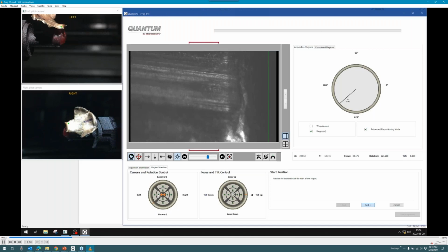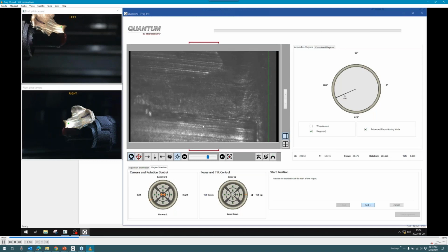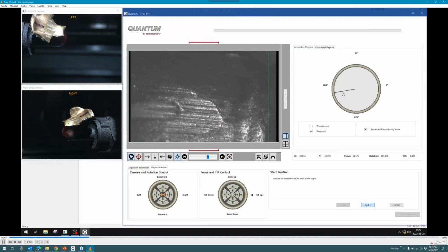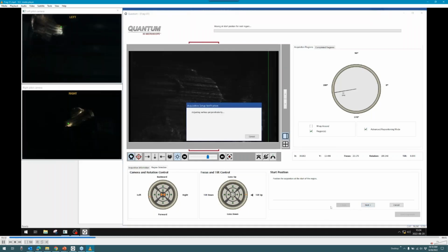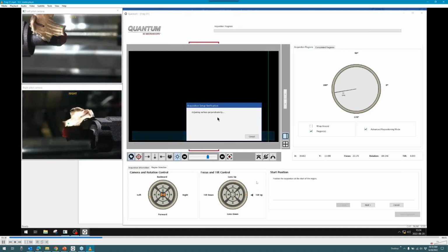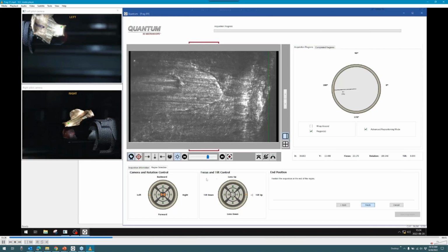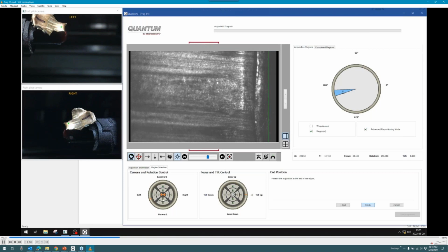And while I'm rotating, I want to see what effect rotation has on the way the light is reflecting on the surface. Because when the apex point of the surface, the tippy top of that surface, is directly underneath the camera and the lighting, it's going to reflect at its strongest. So I want to find the strongest reflection in the area where I wish to begin, and then I'll set that as my starting point. And as I do set that as a starting point, it is going to do a test scan to adjust the perpendicularity to the shape of the bullet. If it's looking down here now and it sees that that shape it now recognizes is not perfectly perpendicular, it will make an adjustment for the sake of the quality of the light reflection.